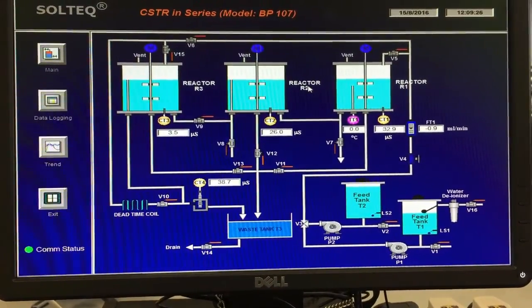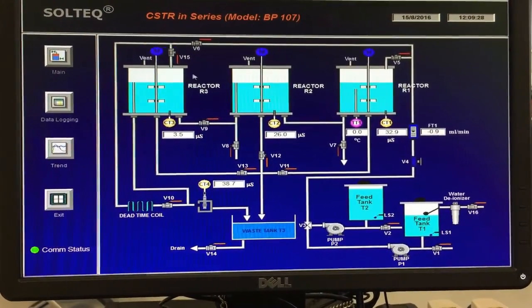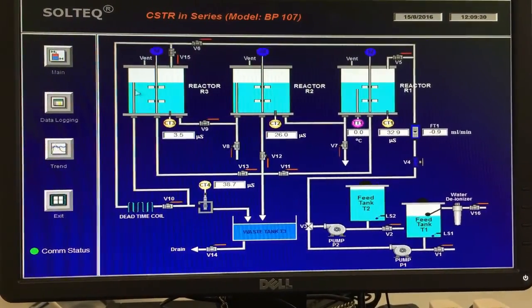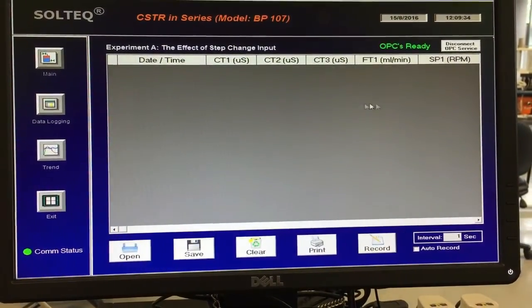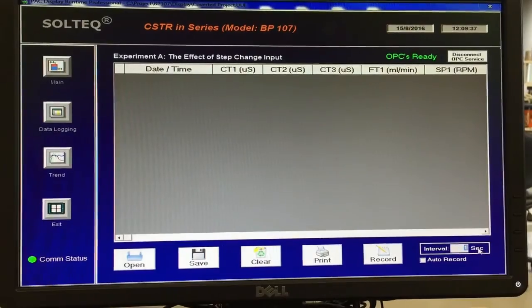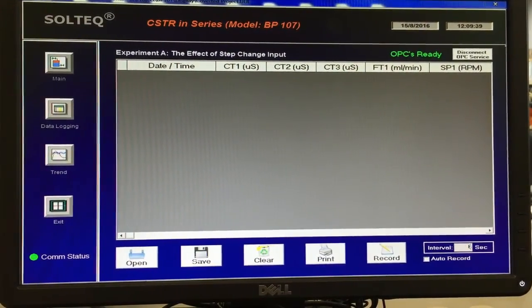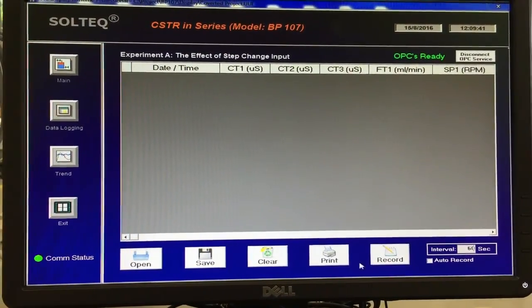We then open the data acquisition system. The cursor is directed towards data logging and experiment A is clicked. Conductivity values of CT1, CT2 and CT3 is recorded at suitable intervals. Continue recording all the conductivity values until all readings are almost constant.